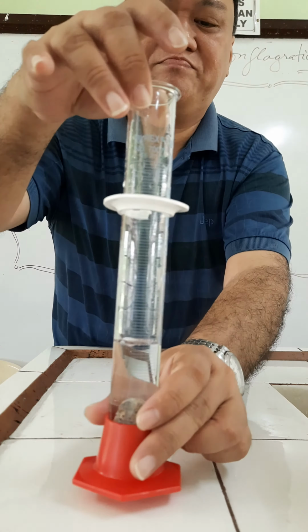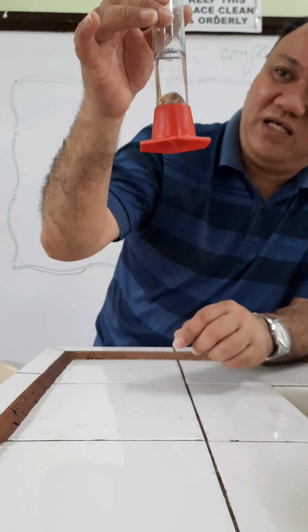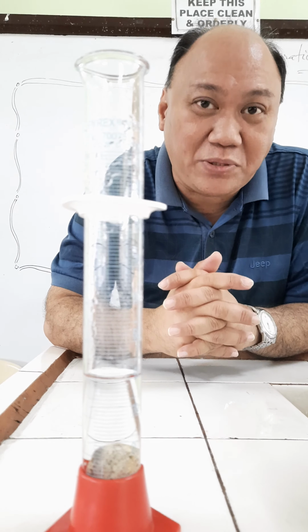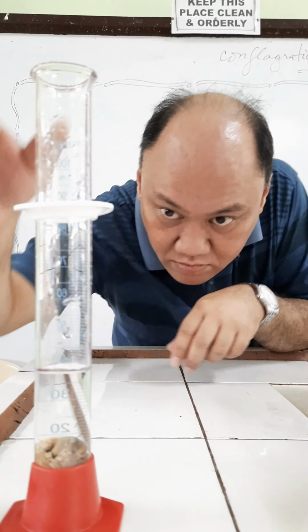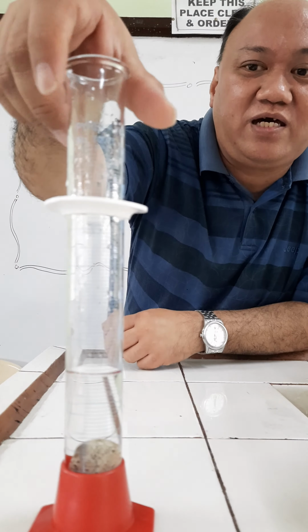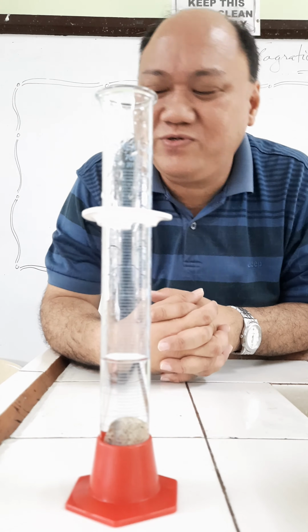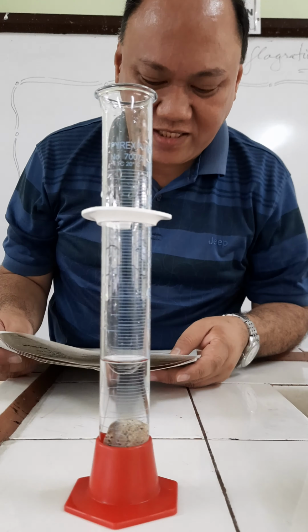Okay, there we go. Now try to see the increased level of water inside the graduated cylinder and call that the final volume. Okay, reading from the lower meniscus, I can see from here that it is now at the 40 ml mark. To do that, try to read the procedure and record the data.